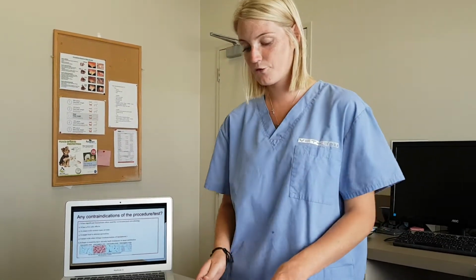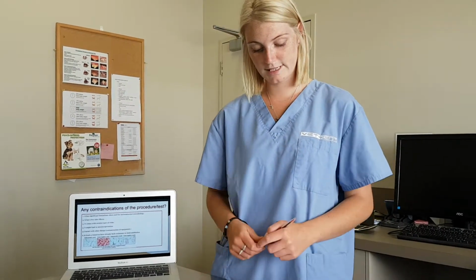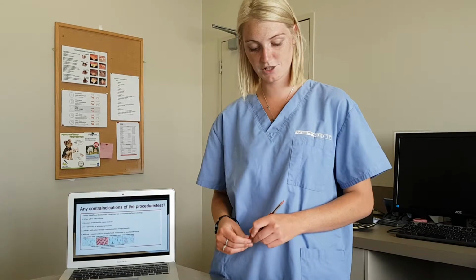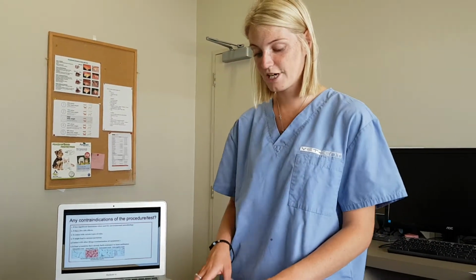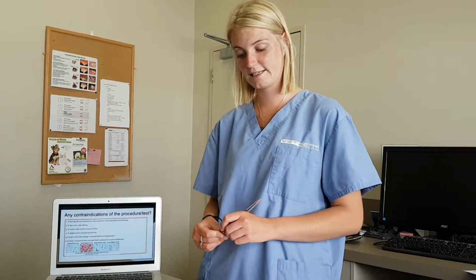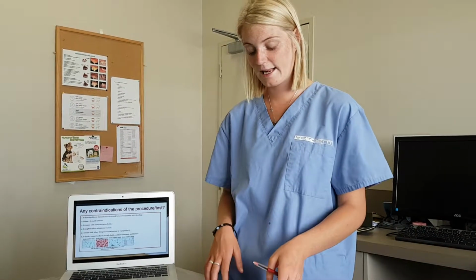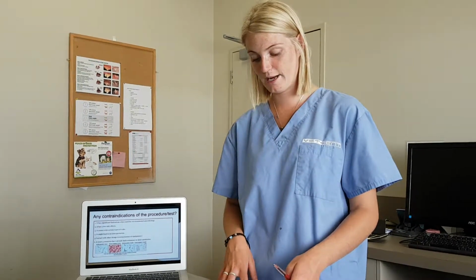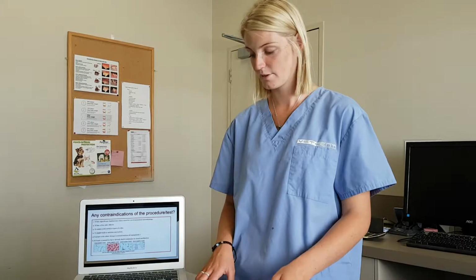And then, any contraindications of the procedure or test. I've just come up with a few things, not many. There are significant limitations when it is used for environmental microbiology. It has a few side effects, it comes with certain types of risks, and it might lead to misinterpretation, but that's very low.